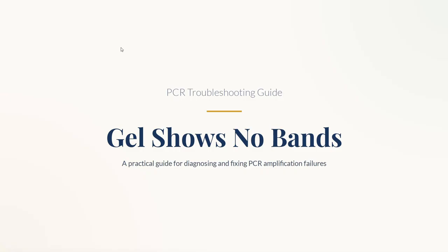So today we'll be learning PCR troubleshooting, that is, when your agarose gel doesn't show any bands when you run a PCR product. So what could be the issues that we'll be learning today in this video? You must be knowing about PCR. Many of you must have faced this issue that even after loading and making the gel properly, you don't get to see the bands. That means your template has not amplified properly. So what could be the reasons that we're going to see today?